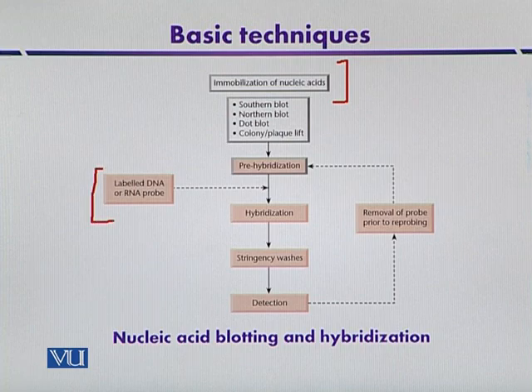So this probe may be a segment of DNA or RNA that is labeled with any radioactive material like P32. And if the DNA sequences of the target DNA and probe are complementary with each other, then hybridization will take place. Hybridization means the formation of a double-stranded molecule from single-stranded molecules. To enhance the hybridization so that only complementary base pairing is there, stringency control is also applied.